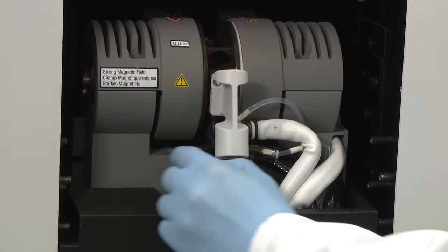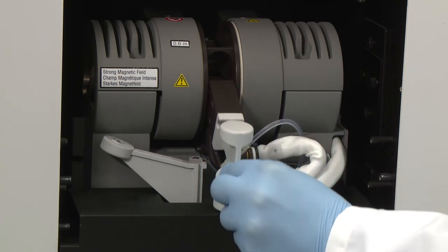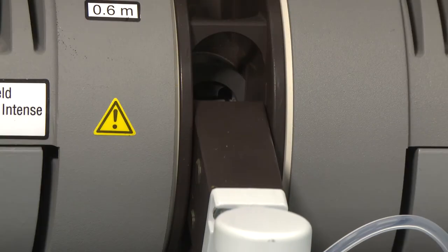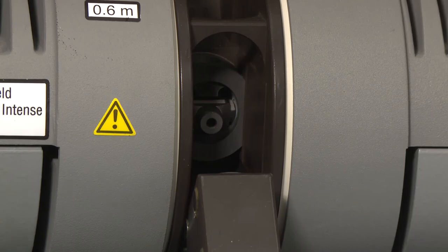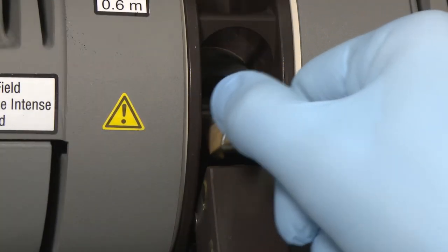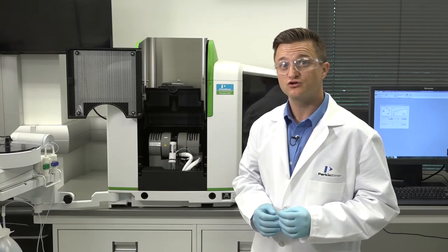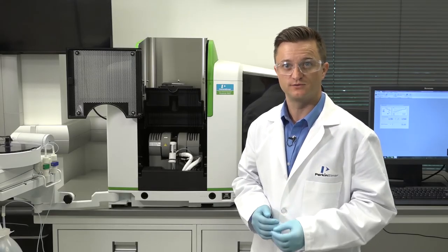Next swing the support lever to the side and tilt the front contact housing downward. The graphite tube is now visible in the rear contact. Use the insertion removal tool provided to remove the graphite tube. To prevent contamination, make sure you do not touch the tube with your bare fingers.